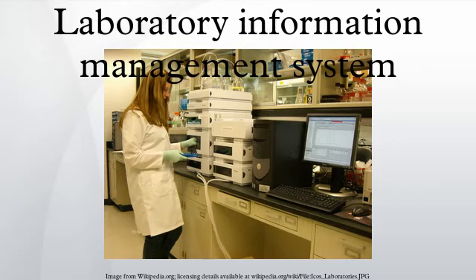In 1982, the first generation of LIMS was introduced in the form of a single centralized mini-computer, which offered laboratories the first opportunity to utilize automated reporting tools. As the interest in these early LIMS grew, industry leaders like Gerst Gibbon of the Federal Energy Technology Center in Pittsburgh began planting the seeds through LIMS-related conferences. By 1988, the second-generation commercial offerings were tapping into relational databases to expand LIMS into more application-specific territory, and international LIMS conferences were in full swing.